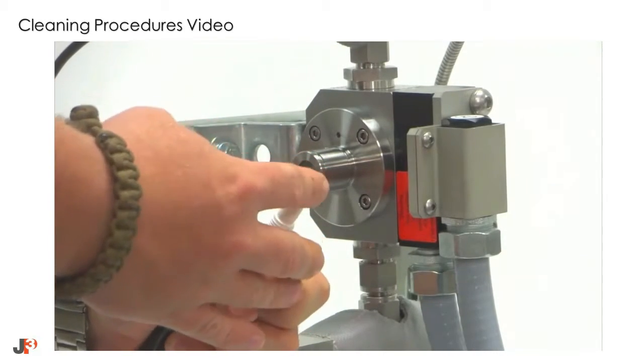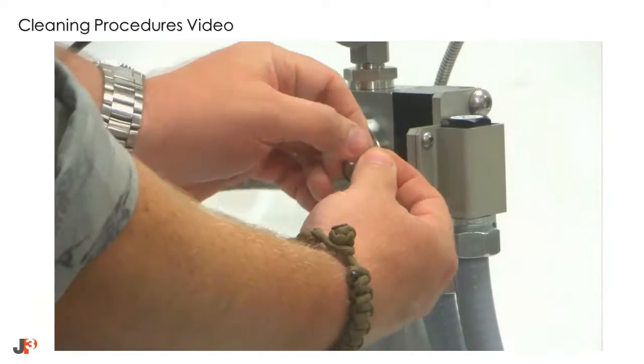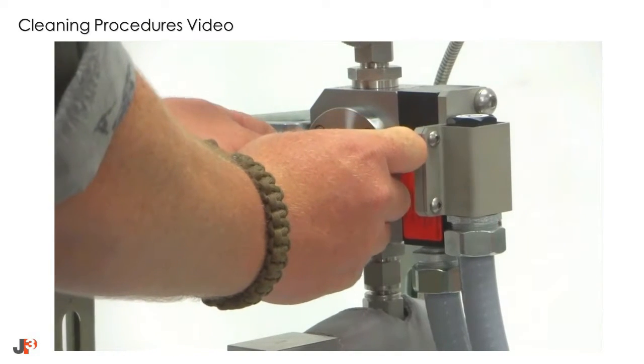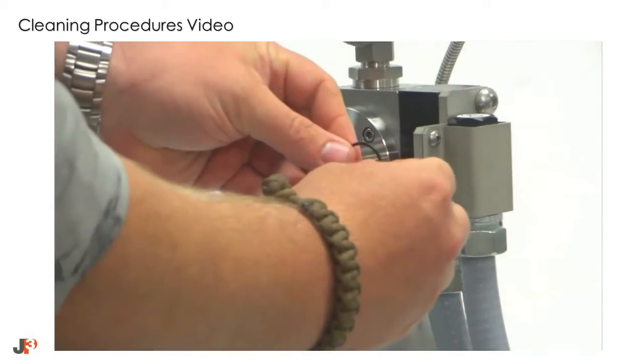Using a small amount of lubricant on your fingers, lubricate both O-rings prior to reinstalling them. Running the O-ring through your fingers, press together.